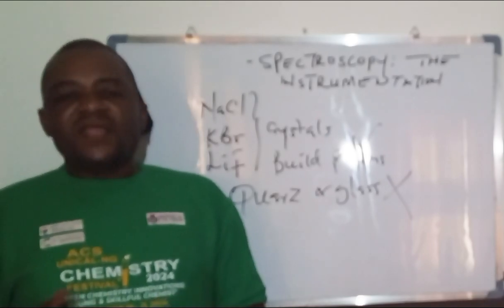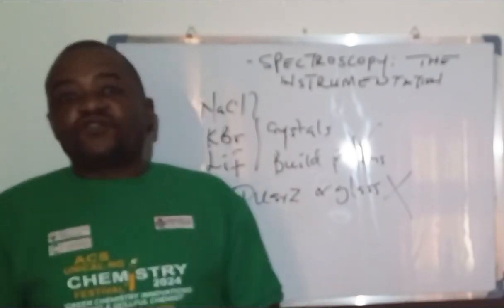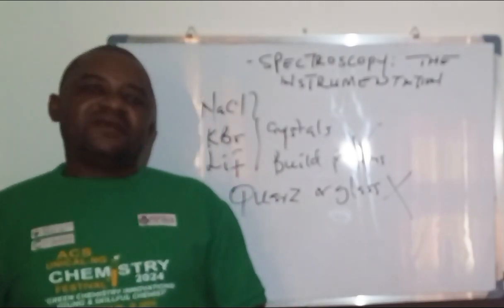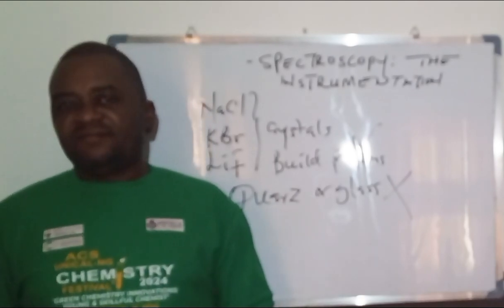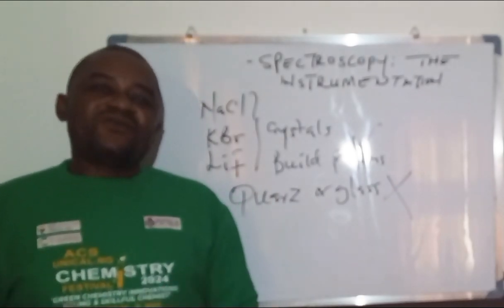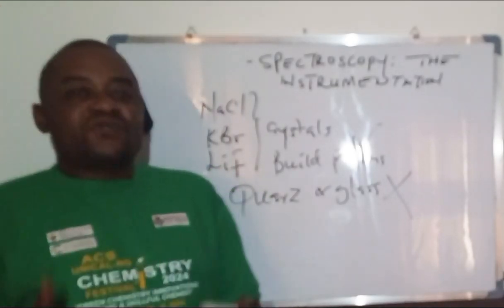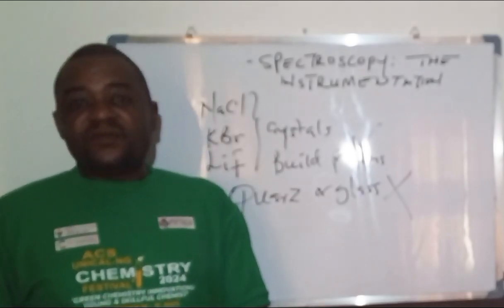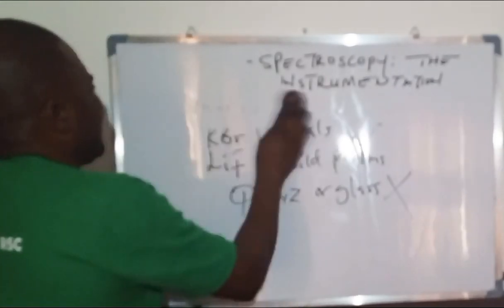Again, there is a possibility that through IR spectroscopy all your radiation is absorbed by the sample, and if it is completely absorbed, you have a zero transmittance. So it is usually advised that you make use of the transmitted radiation. But let us take a look at what we mean by the IR absorption spectrum and the transmittance spectrum.